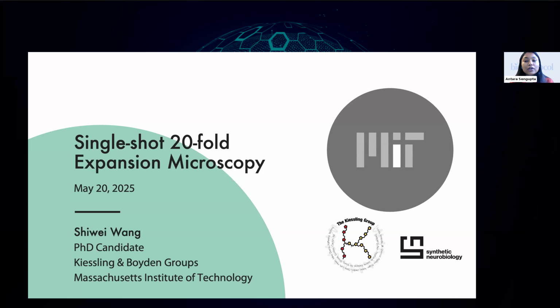As many of you know, Bioprotocol is an open access, peer-reviewed online journal dedicated to making life science research more transparent and reproducible. We thank you all for joining us today and being part of this mission. We are elated that we can host this webinar today on a topic that has been strongly suggested by the audience community itself. In today's session, we will explore the latest advancements in a powerful imaging technique that enables researchers to visualize biological structures at the nanoscale using conventional microscopes. We will take a deep dive into next generation expansion microscopy, 20-fold magnification in one step.